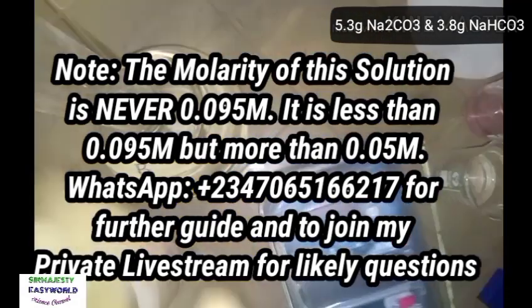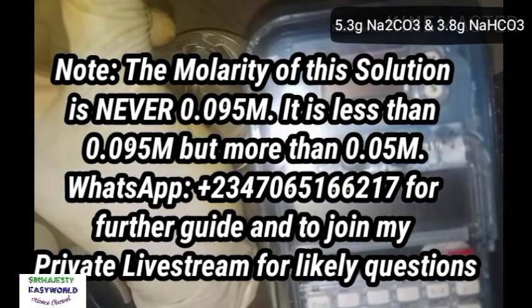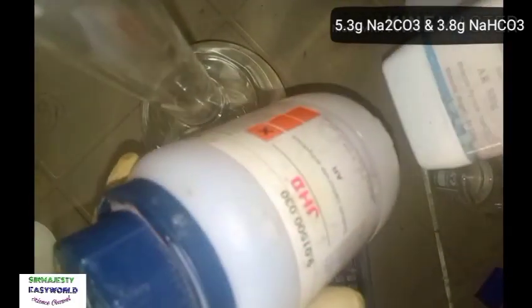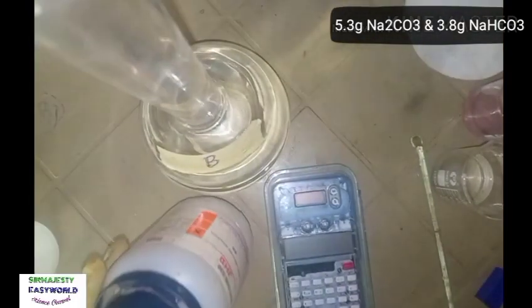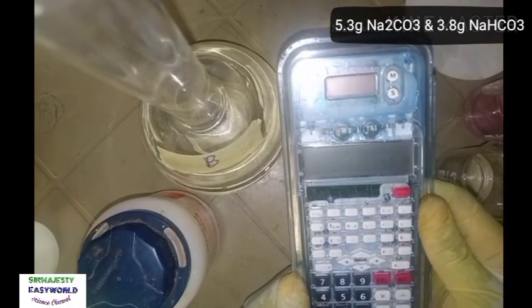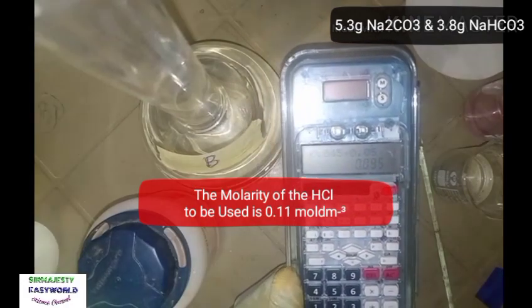But this is not true. This solution is not up to 0.1 or 0.095. It is not. The reason is because this bicarbonate is acidic and this is a normal salt. So since I've mixed the two, this bicarbonate is also being neutralized to completeness by this normal salt to give you more of this carbonate. So you don't just sum it up that way. It is not, because if it is 0.09, you see that your endpoint will be close to 50 or more than 50, because the strength of the acid they used is about 0.1 mole, of course.